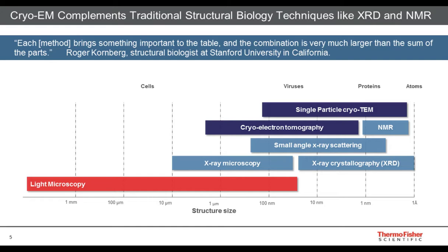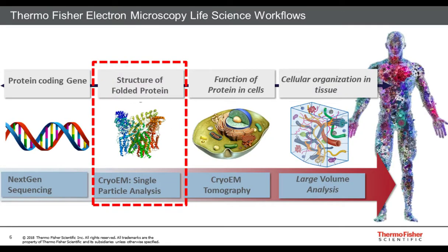course light microscopy. Basically, they have their own scale in the landscape of technologies, and as Roger Kornberg rightfully said, each technology brings something important to the table, and the combination of the technologies makes the sum most powerful. So it's all about complementary technology. It's not that Cryo-EM necessarily will replace some of these technologies. Everything adds a piece of the puzzle in this respect. What is this piece of the puzzle?